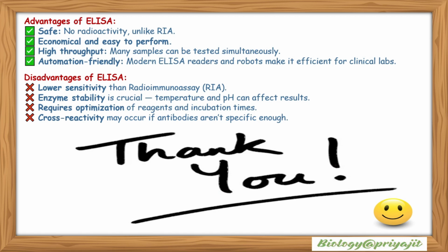Disadvantages of ELISA include lower sensitivity than radioimmunoassay or RIA. Enzyme stability is crucial because temperature and pH can affect the results. It requires optimization of reagents and incubation times. Cross reactivity may occur if antibodies are not specific enough.